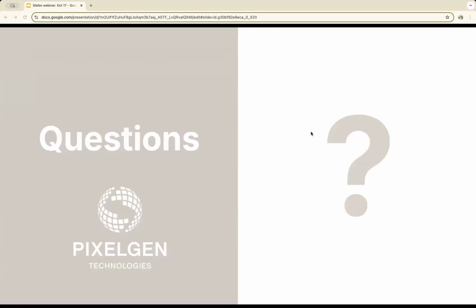And with that, I think I have covered what I wanted to, and I would like to see if there are any questions. I can't see any questions. Maybe we give them some time to write. I can ask a question. So, Stefan, can we visualize cell-cell interactions?